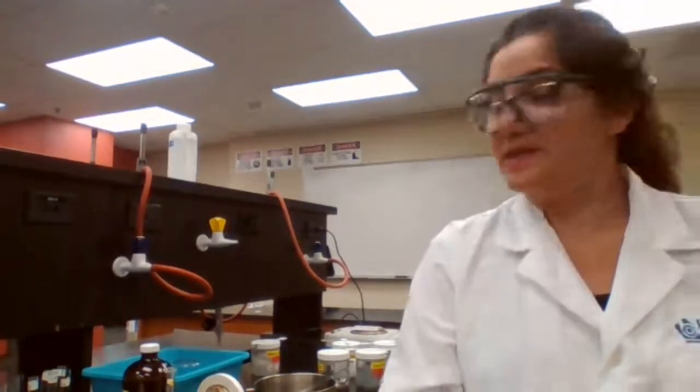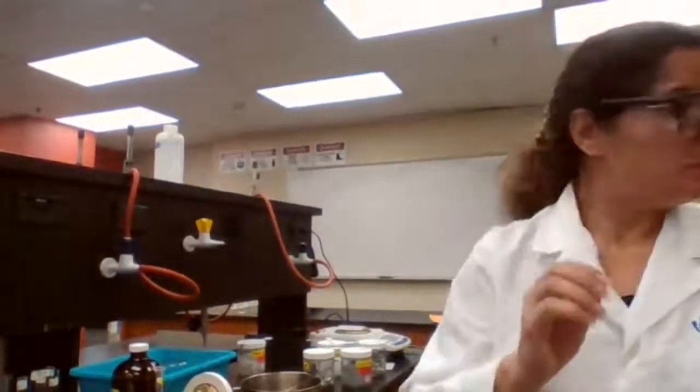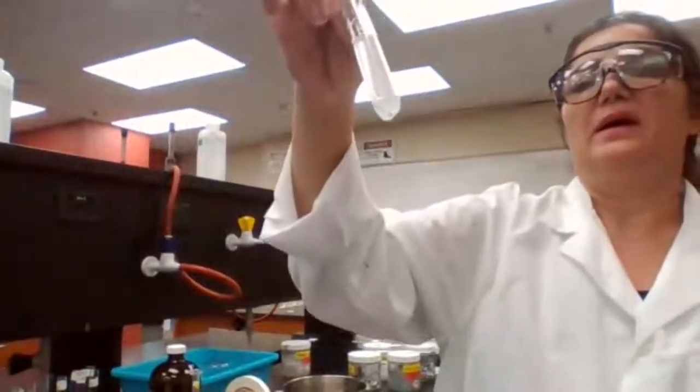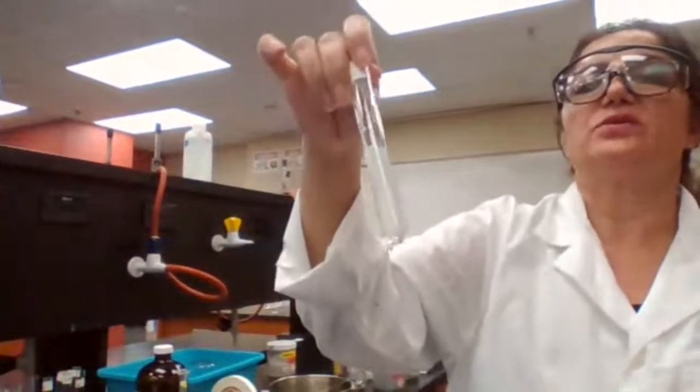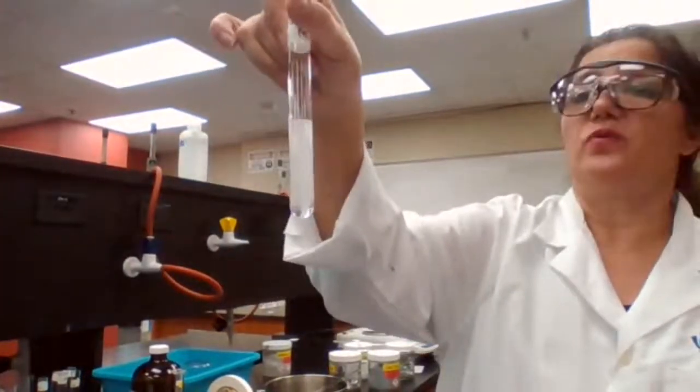I need 5 ml of 6 molar HCl in 2 test tubes. I'm going to bring it, have it ready. I'm not putting any data in until we are done with this part. I'm just getting ready for part C of the experiment because this one still is reacting. I don't want to make data so they come in order, but I can use the time while we are waiting.